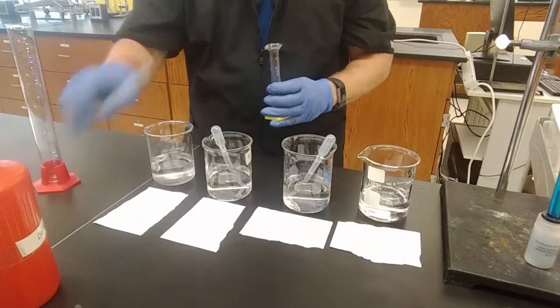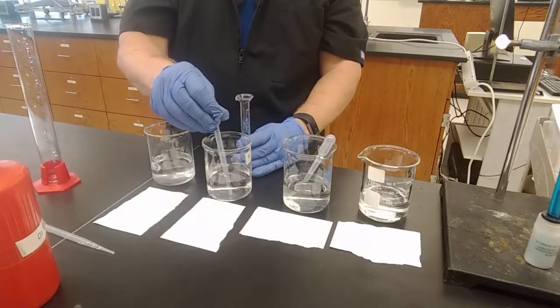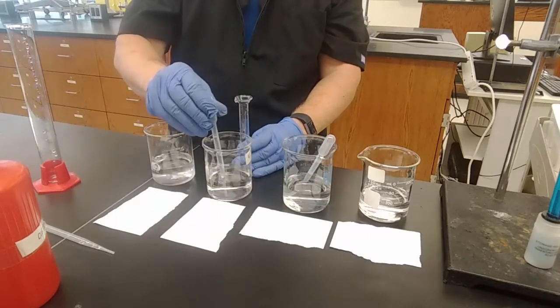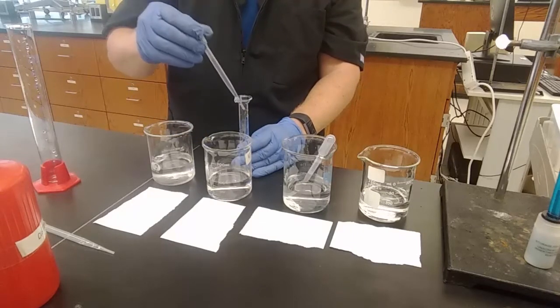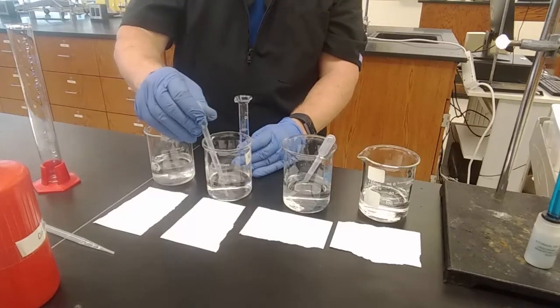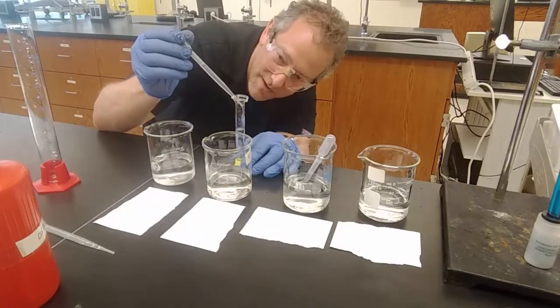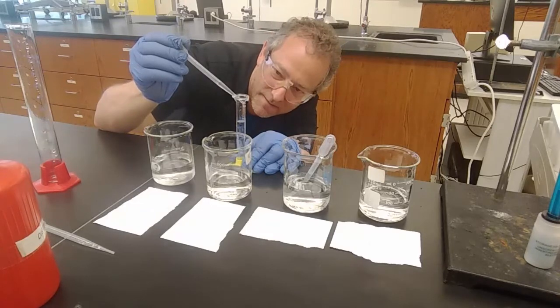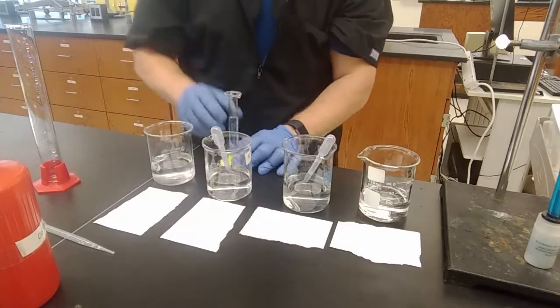And I'm going to take 10, nope, we already had a 1 and 3. Pipette in 3. I'm going to take 10 milliliters of 3, 90 milliliters of water. Again, we're ignoring the fact that solutions can expand or contract upon mixing. Close enough for this lab. We'll see how exact I make my solutions up when we measure their pH.